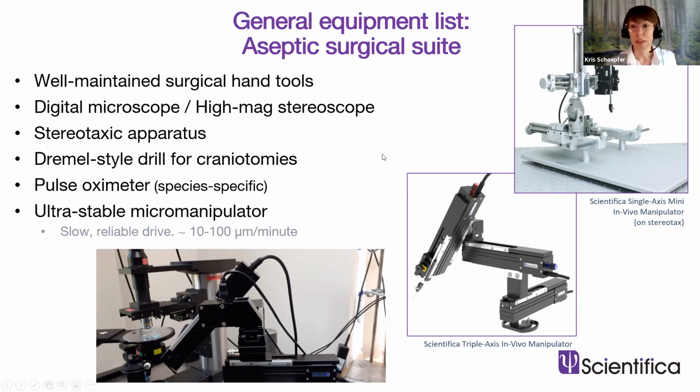And it is known that generally speaking, the slower that you drive this external hardware into the brain, the better results you'll have. So you'll have less inflammation, less gliosis, and general specs, depending on the type of hardware, depending on if the implant is going to be chronic or acute, and the tensile strength, so how hard the implant is. The speeds can vary, but typically somewhere between 10 and 100 micrometers per minute, so a very slow drive.